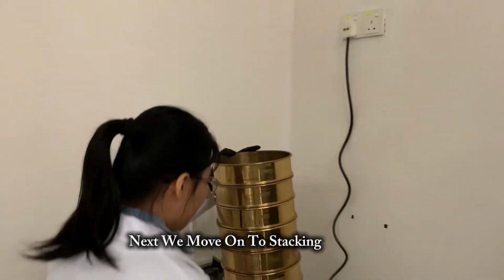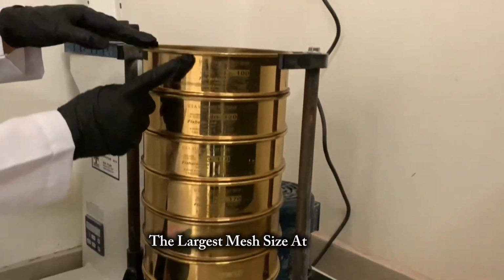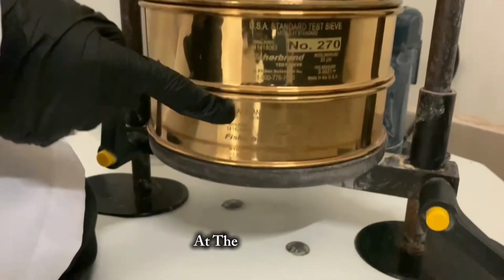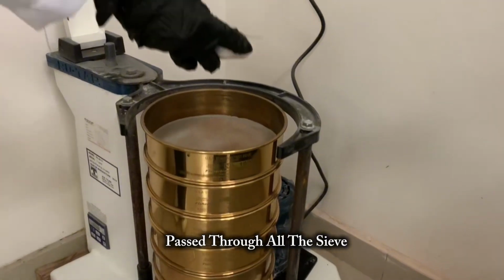Next, we move on to stacking the sieves. We arrange them in order, starting with the sieve that has the largest mesh size at the top and going down to the smallest mesh size. At the very bottom, we place a receiving pan to collect any fine particles that have passed through all the sieves.